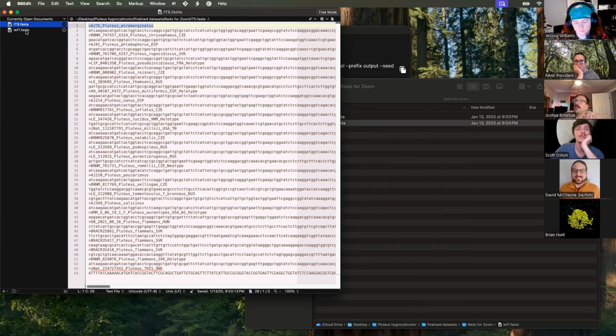And we can look at how I do that differently, and some of my pet peeves around how people put that data into GenBank, because for the same specimen people will use different punctuation, use a space sometimes, not use a space sometimes, put extra information. So you can't literally just put it all in one data set. You have to manually fix the fact that sometimes it's under specimen voucher, sometimes it's under isolate, sometimes it's under biomaterial, sometimes INAT is spelled out to iNaturalist, sometimes it's www.inaturalist.com/observation/inat number. It's always formatted differently because no one ever does anything the same.